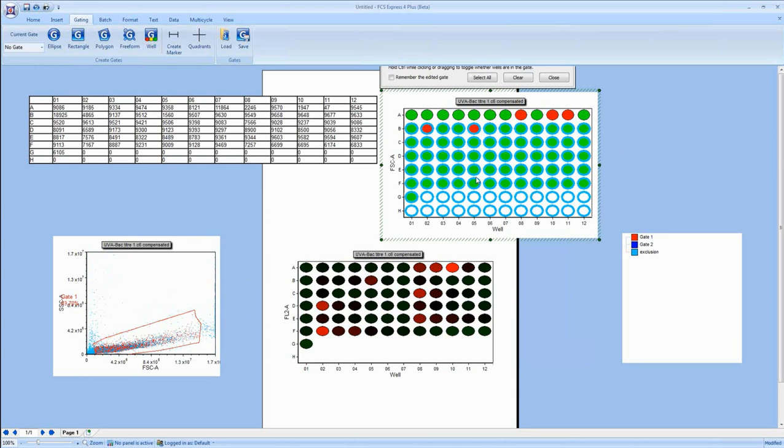So this is a great way to come in and cherry pick which data you'd like to remove. If you're doing a batch process with this data, you could always pause in that batch process to come in here and have an exclusion step to really do some really good high quality control on your experiments as you're running them.